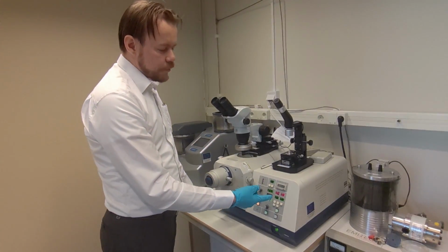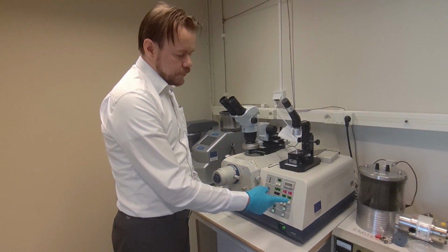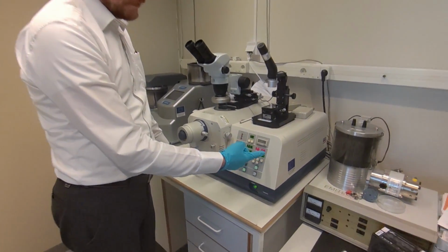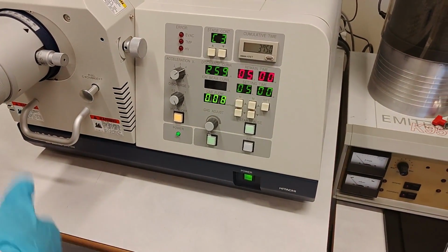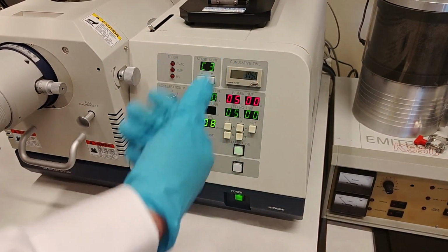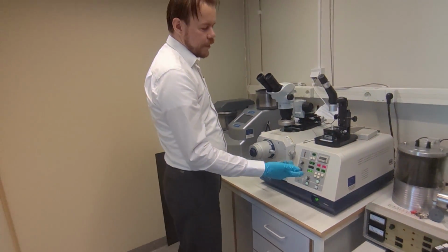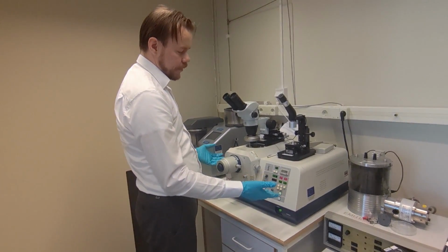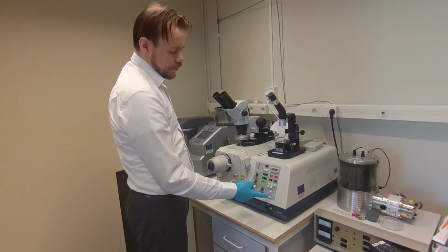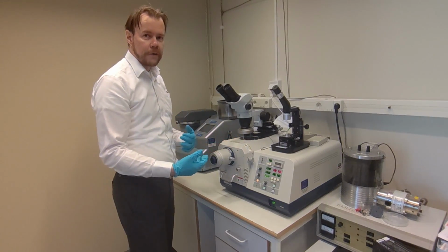And if I find out that 5 hours has passed and I need to run it more, well, you can just pause it here, we set a new time and continue. And of course, if you think after 2 hours this looks fine, then you just stop it. So what's happening when you are done? Either you reach this stage, I'm happy with the result, then you can just stop it, and then you turn off the high voltage, and then you hold this air button to release the vacuum and fill it with air, and then you can pick out your sample.